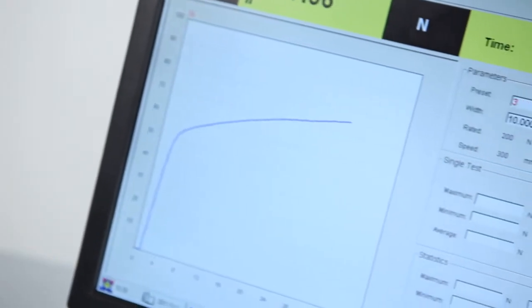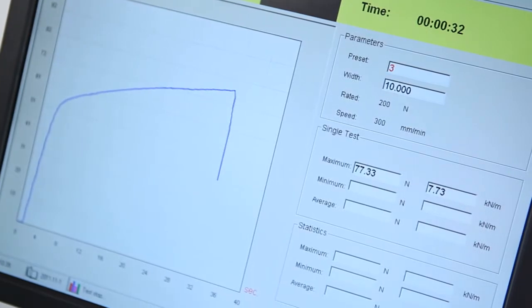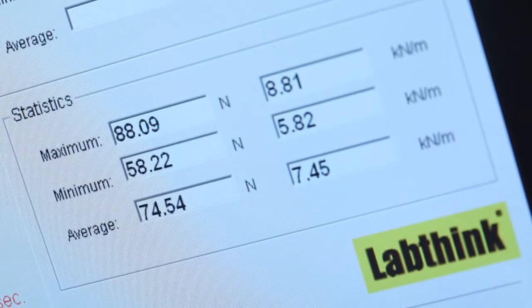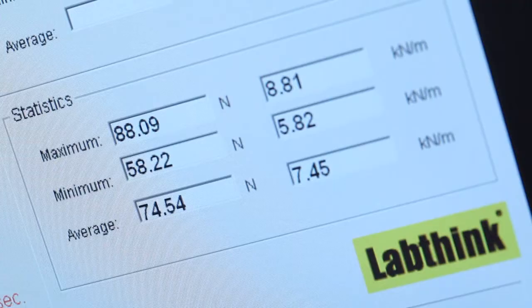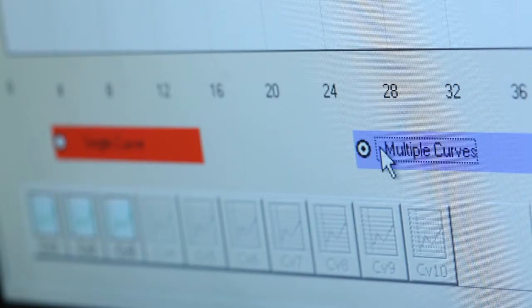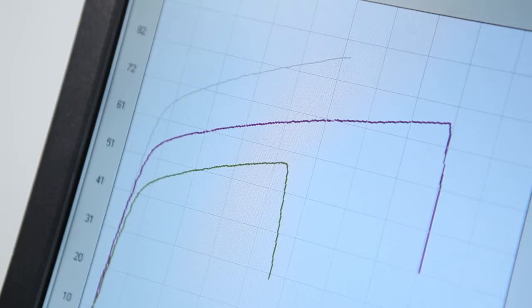The software provides real-time statistical analysis and display of the maximum, minimum, and average testing results. It can perform curve superposition analysis for grouped testing samples.